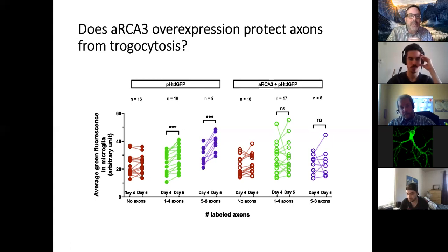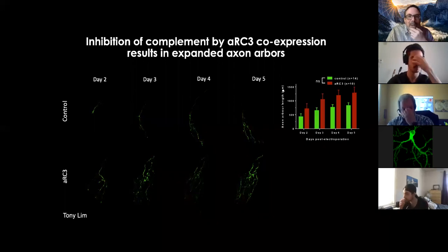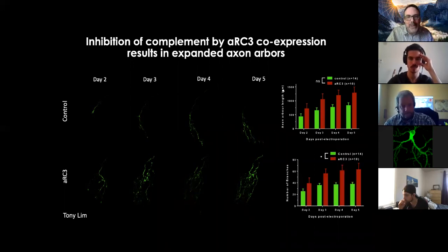We can't say for sure that it's involved in true synaptic pruning. But one thing we can do is go in and just look at the axons and ask, do they grow more or less when they express ARCA-3? It's already quite apparent that ARCA-3 expressing axons are much larger over time, suggesting less pruning of the arbor, although it could be contact-mediated signaling. It's hard to say for sure. So they're both branchier and larger overall. So it does really suggest that complement-mediated signaling is calling the microglia over and causing this interaction.